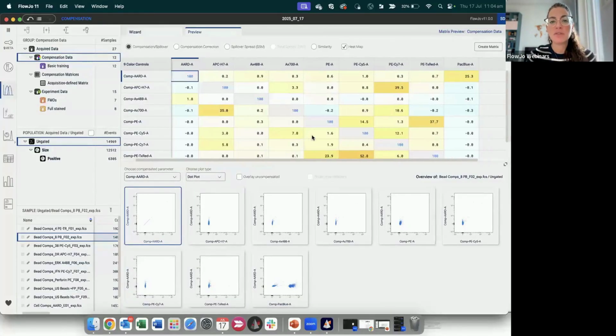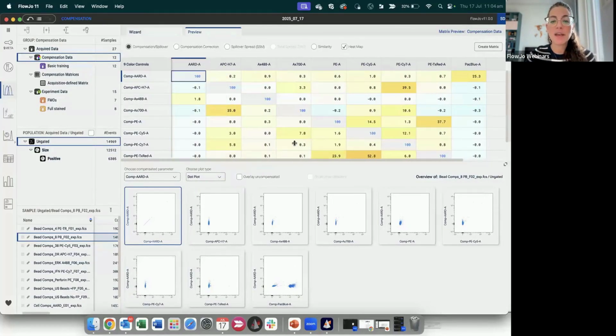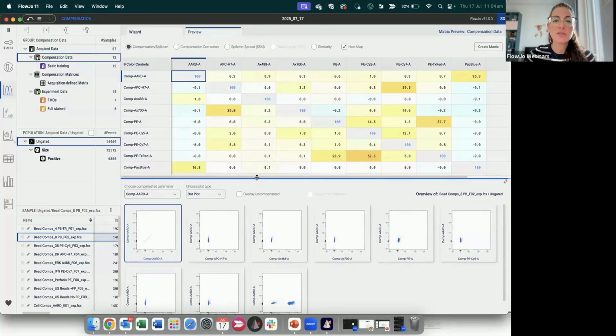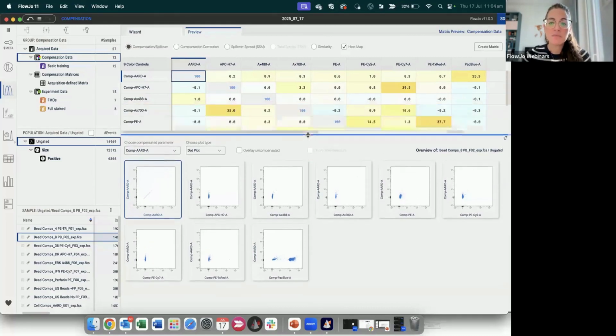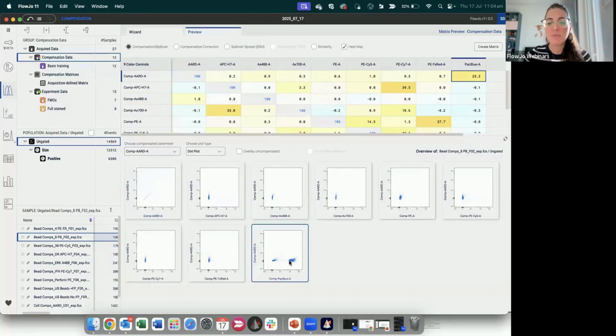And here is our matrix. Now, the best thing here that you could ever imagine is if you want to look at a combination or see exactly where it falls into the matrix, and you see something wrong underneath. So this is one parameter versus the rest, we don't have the n by n anymore. I can just select my plot where I see a weird behavior, and this combination is automatically selected here.